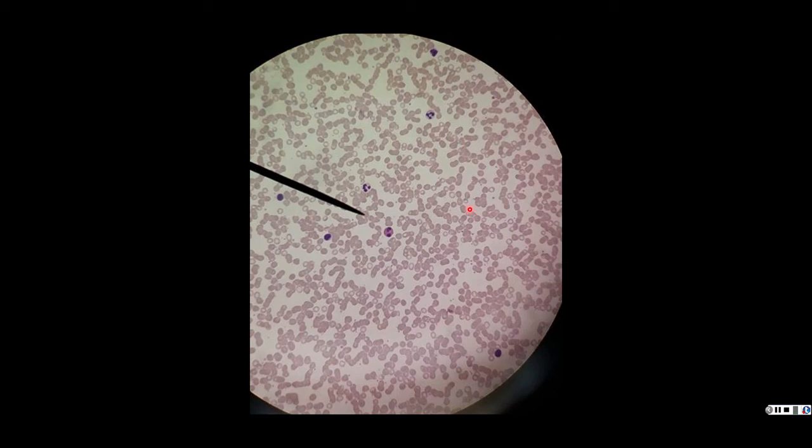we can see here. Scattered around, there's a few different things that almost look like flecks of dust on the slide. Very, very small, just pinpricks of kind of a pink color. Those are called thrombocytes or platelets. These are responsible for causing clotting when we cut ourselves. The reason that we don't just bleed forever is primarily thanks to these thrombocytes, these platelets.